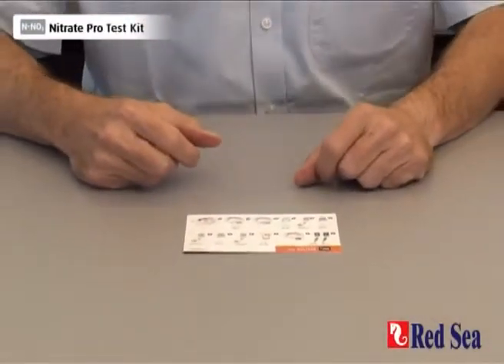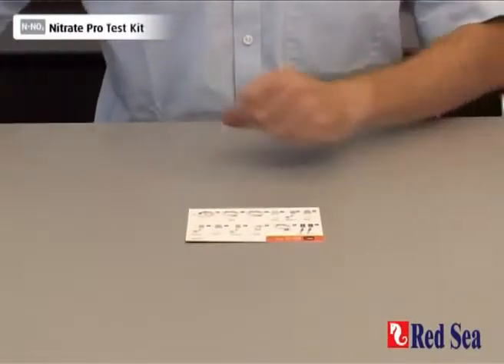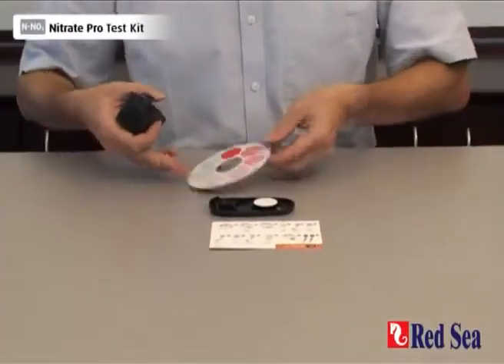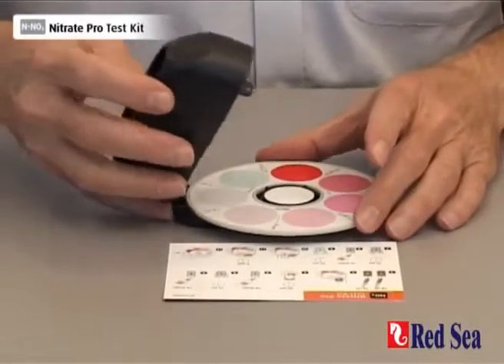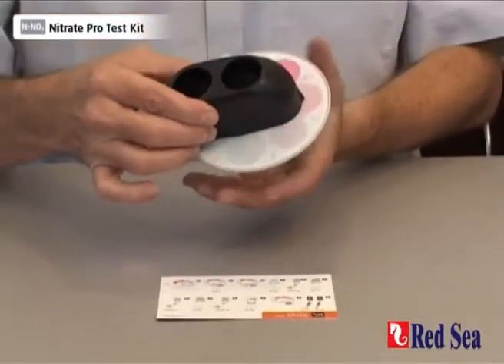Before we can do the nitrate test, we have to assemble the comparator with the nitrate color disc in it. Open up the comparator, place the disc in the center and hinging at the back, pop that into position, and make sure that it rotates easily.